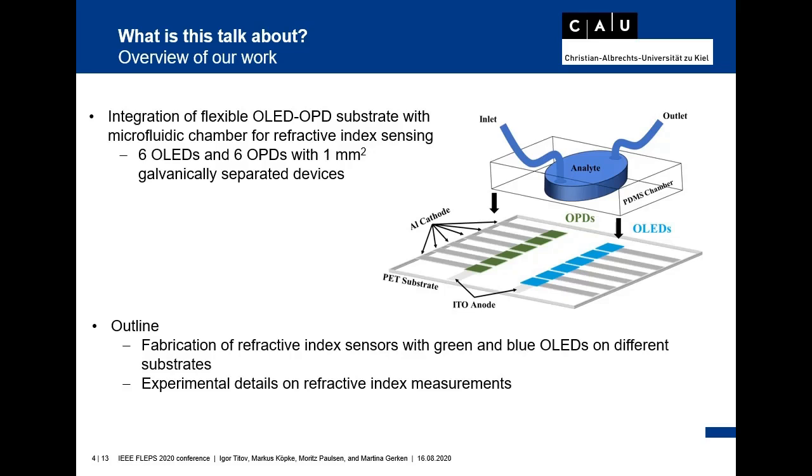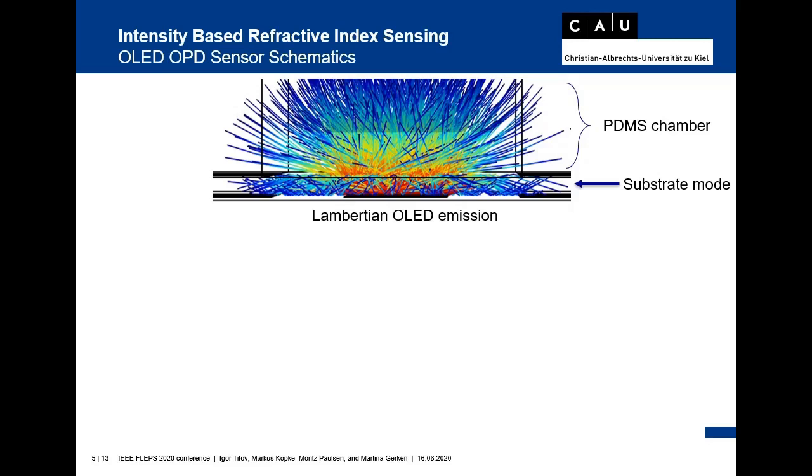As a small outline, I would like to present in the following work the results on monolithic integrated OLED-OPD devices for fluidic applications. We fabricated our devices for comparison with different organic materials, different geometries, and on different substrates. We conducted our investigations with an experimental proof of the refractive index sensing mechanism. Before I go further to the experimental details, I would like to show the schematic of the used system.